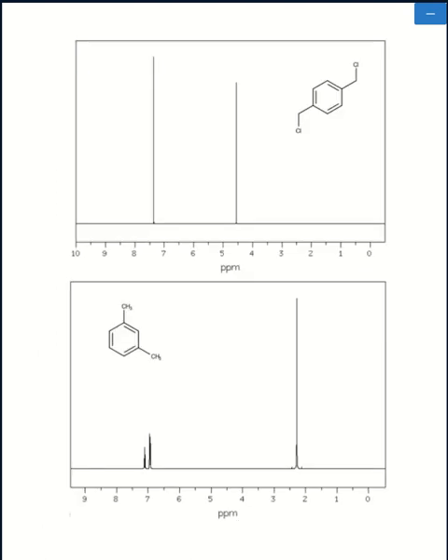Now, another example. The top example and the bottom example are very good for looking at, say, symmetry. Let's fill in those hydrogen. Well, the ring itself, each carbon that only has a double bond and a single bond to neighboring carbons, they each still have 1 hydrogen that is not being shown.